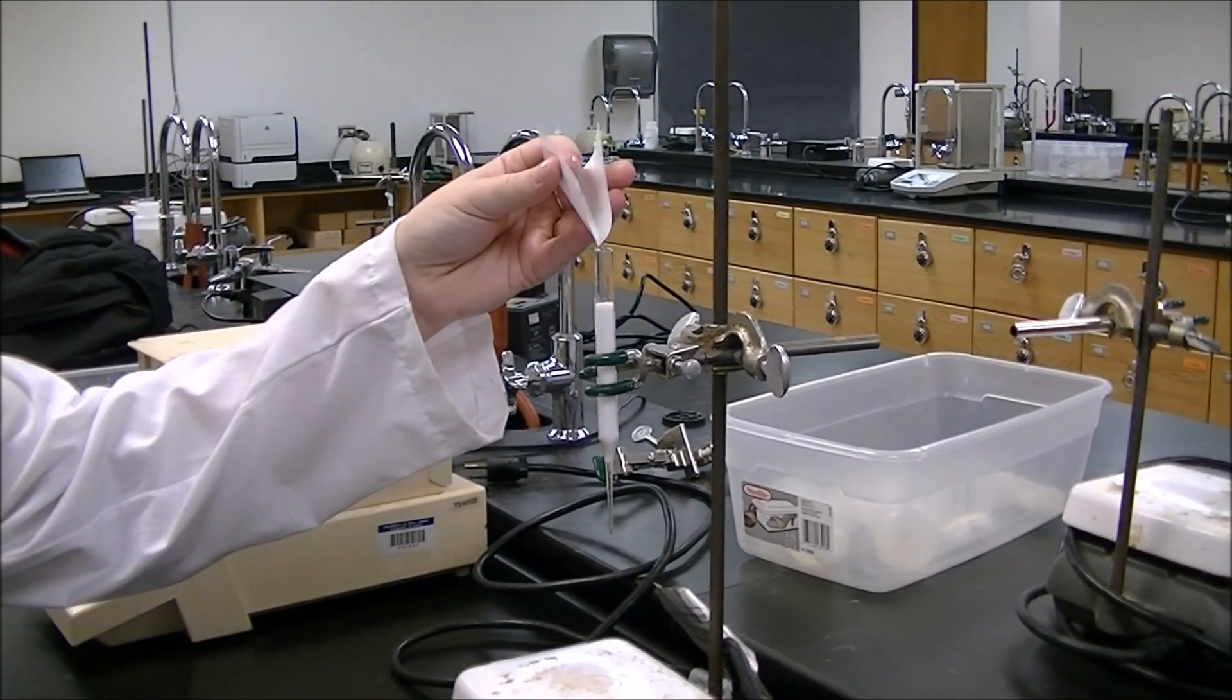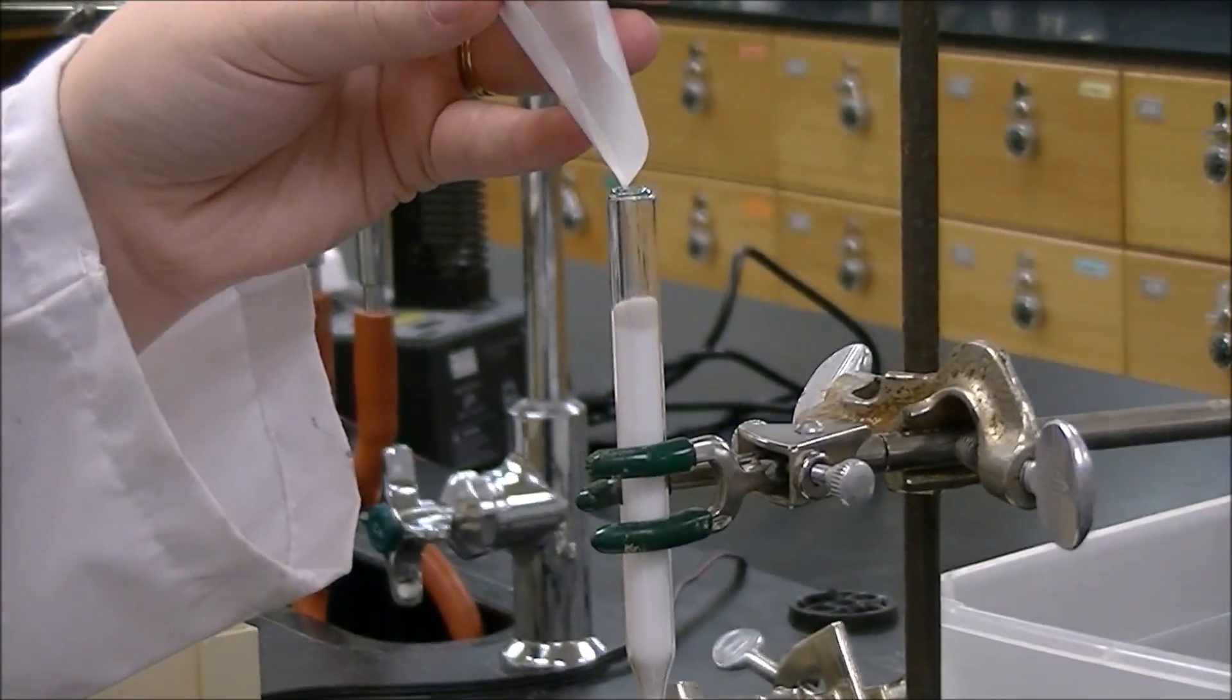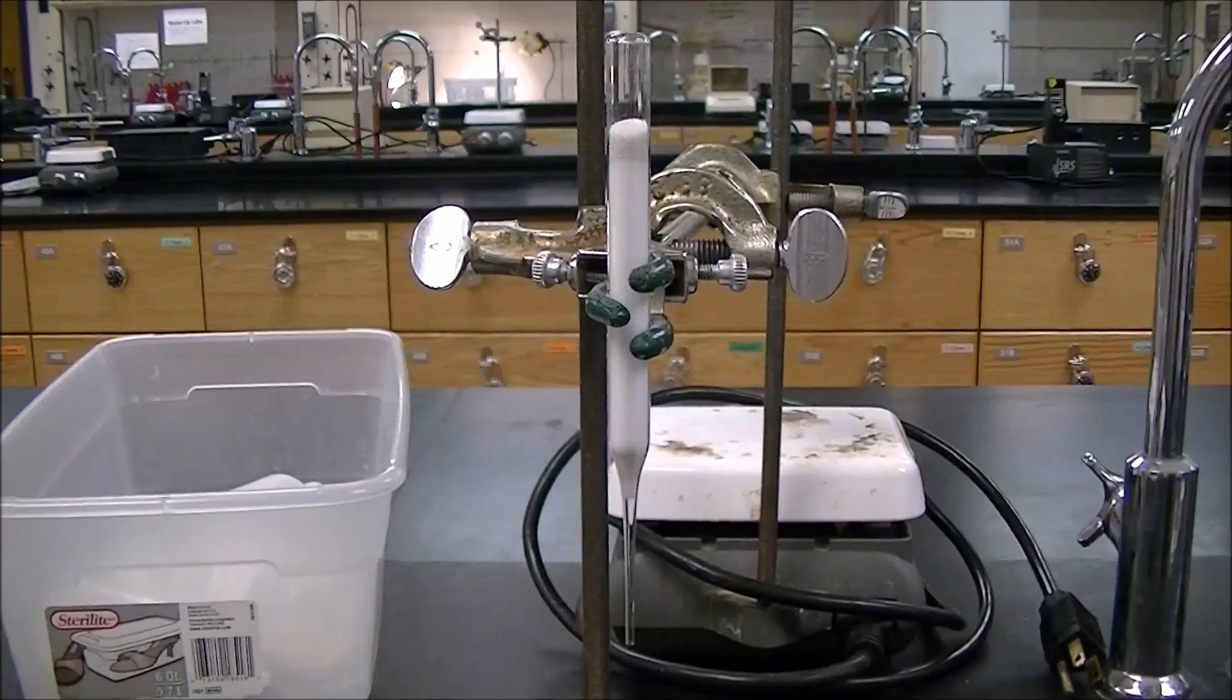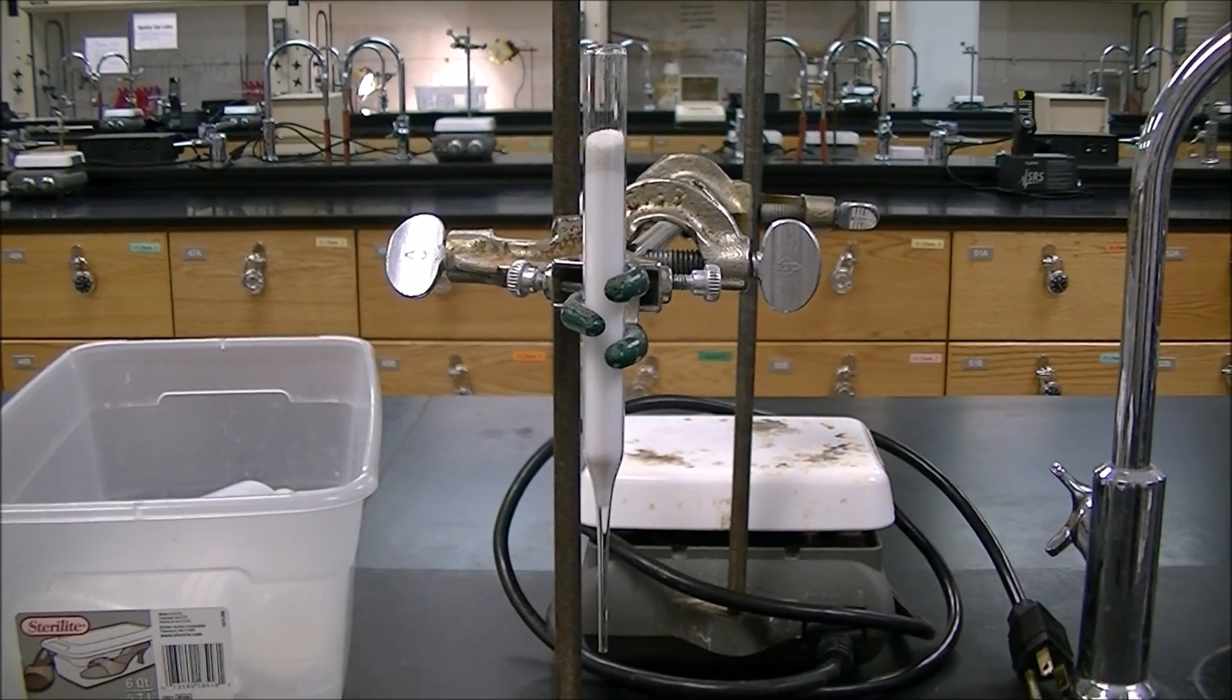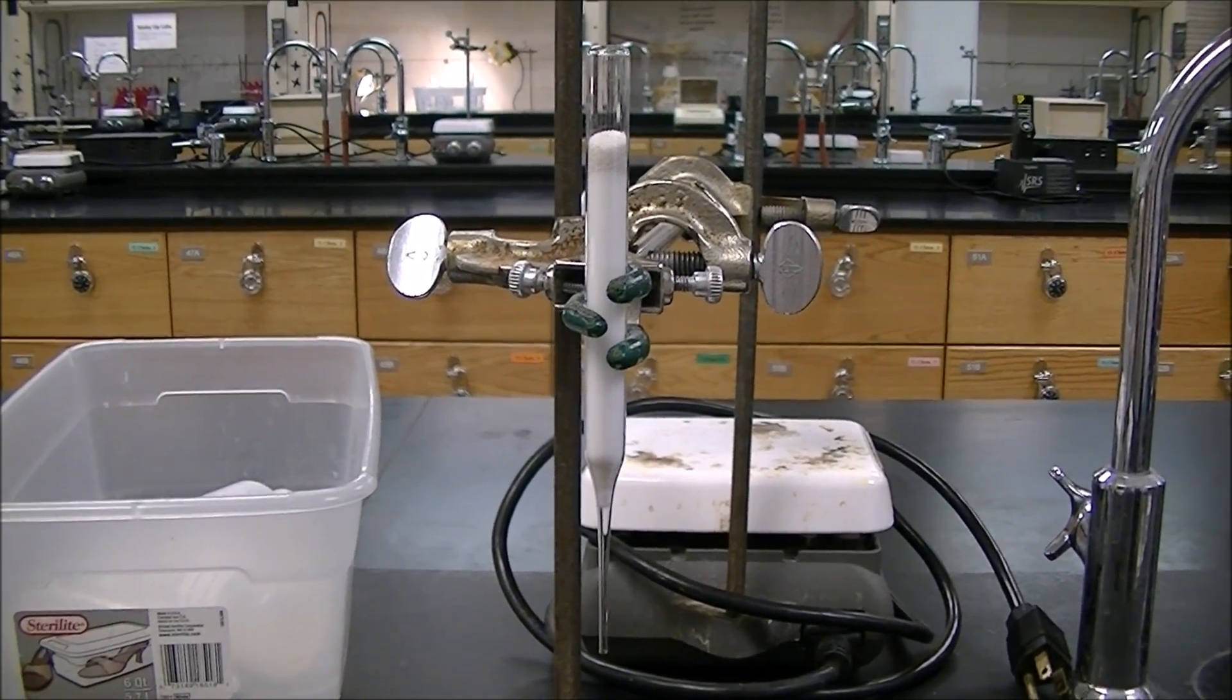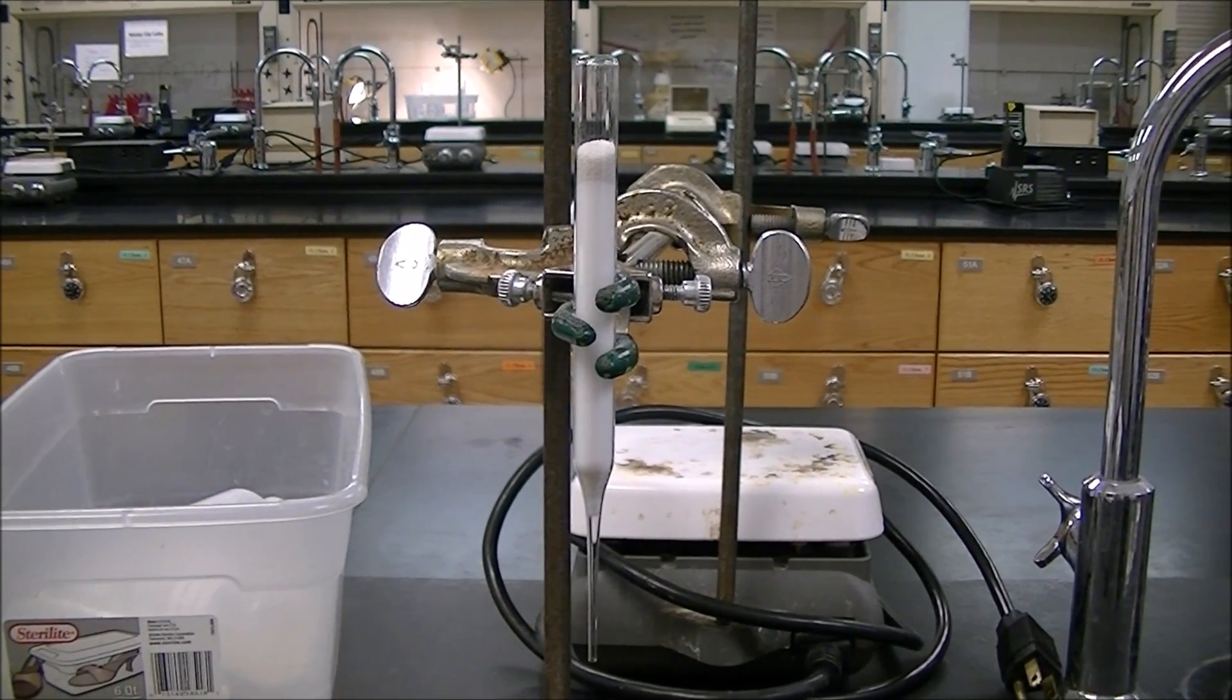Now we'll top the column with about 2 millimeters of sand. Now let's run through this to understand why we've set it up the way we did. The plug and the sand at the bottom prevent the silica from oozing out the bottom. And then the sand at the top prevents the silica from splashing when you add your mixture.